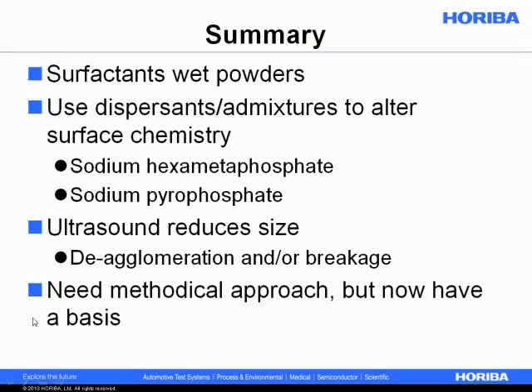So you do sometimes just go to your lab and tinker around and come up with the best way to disperse this powder in a liquid for doing the particle size measurements, but we're hoping that today we gave you a more methodical approach, a little more insight into what's happening with the chemistry and what some of your options are. And now when you take these next measurements with more difficult samples, you have a little more basis of how to approach this in a rigorous manner.